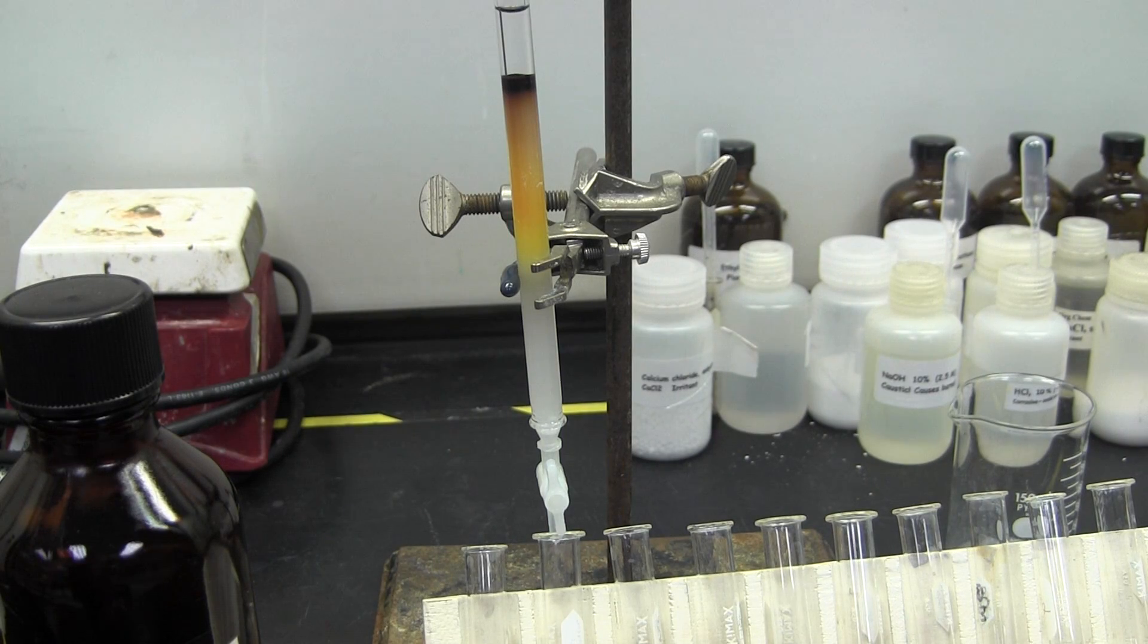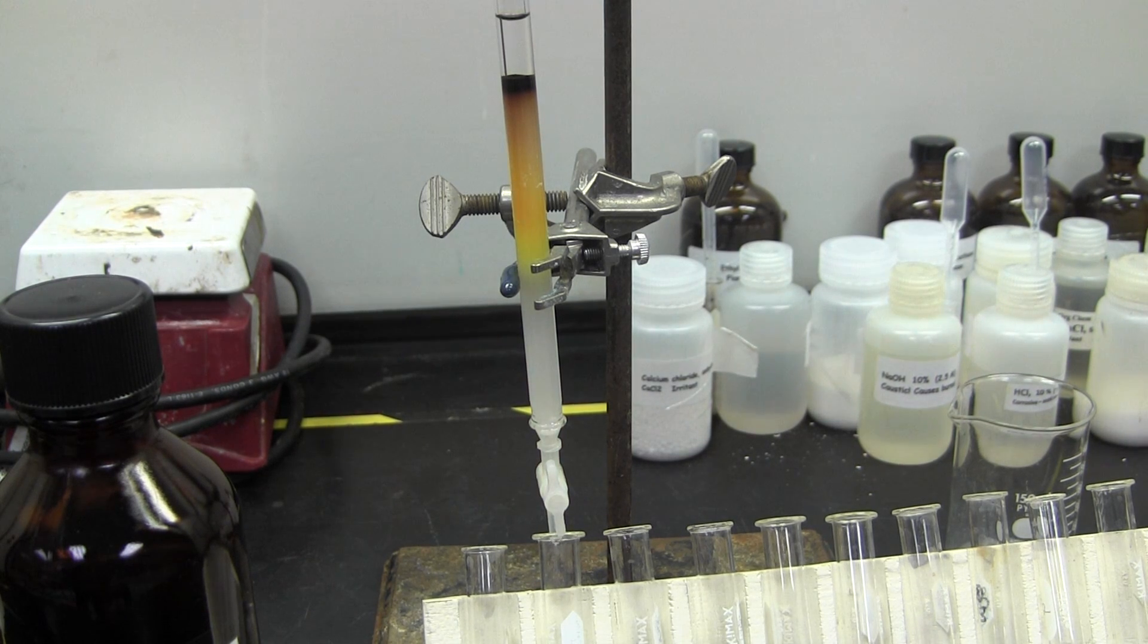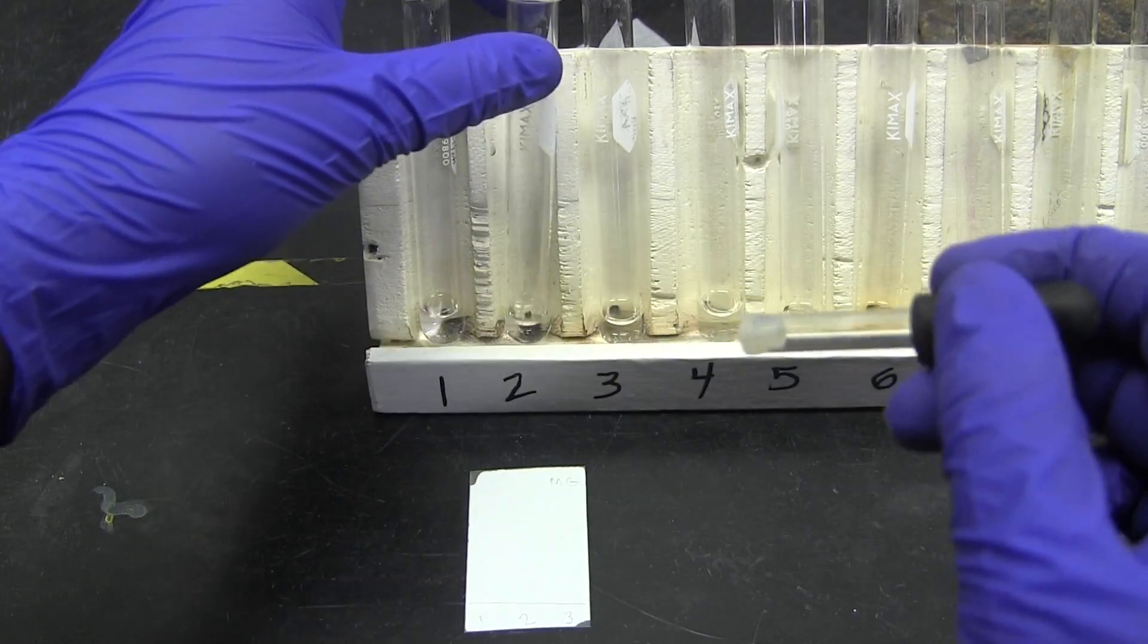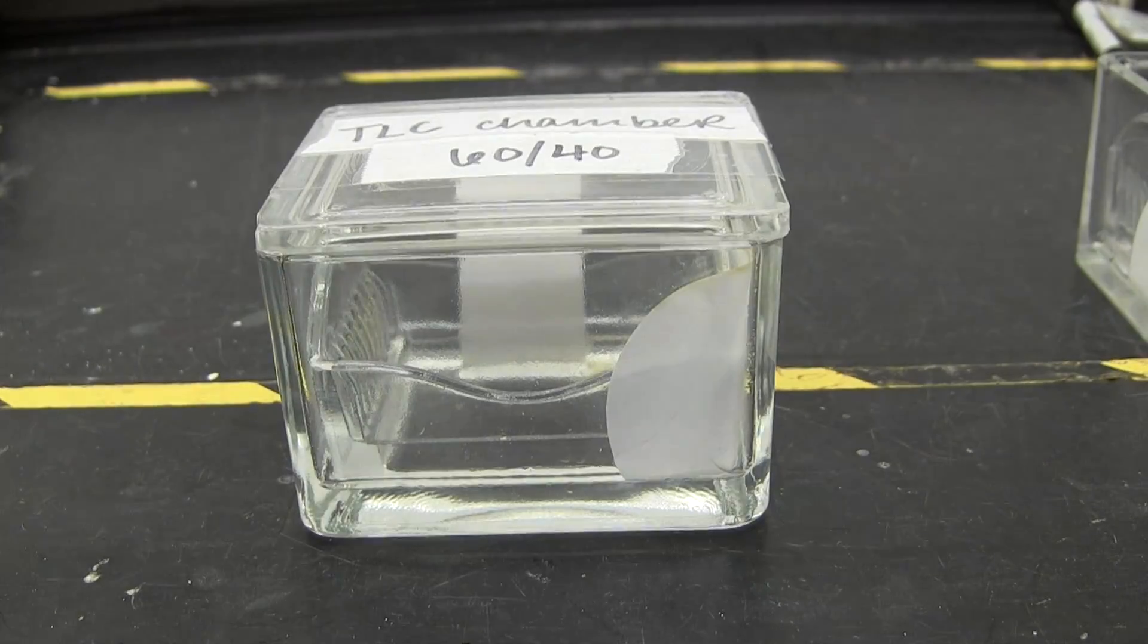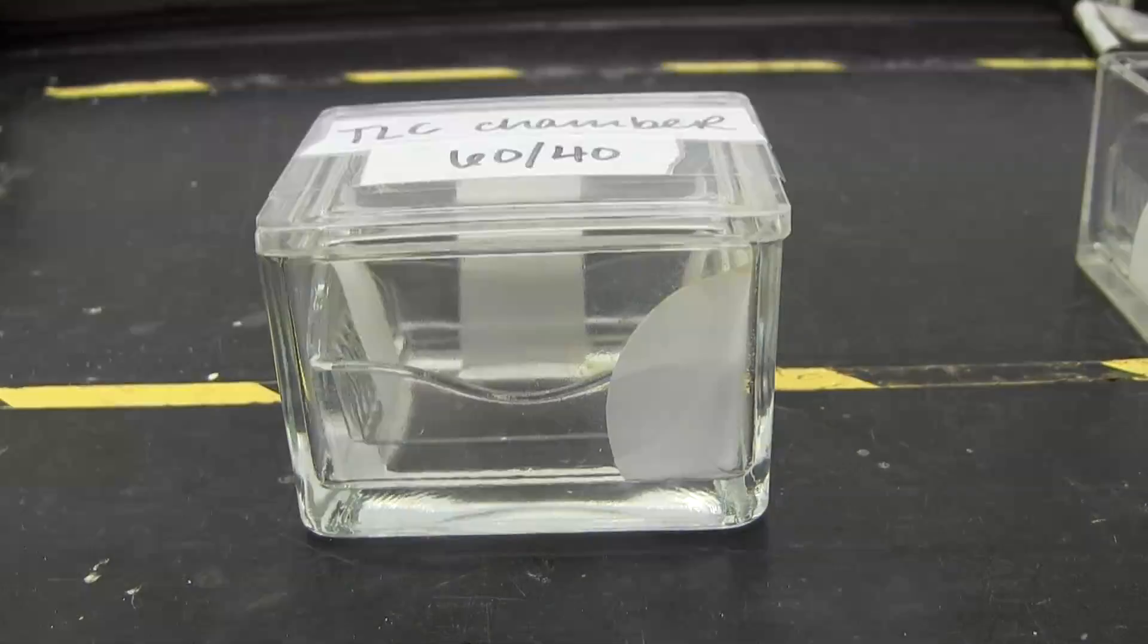Begin collecting fractions of your elutin in test tubes. Each should fill a small test tube about three-quarters of an inch. Use the TLC test to determine which fractions contain which unknowns. Run three fractions on a plate and continue collecting fractions until dots no longer appear under the UV lamp.